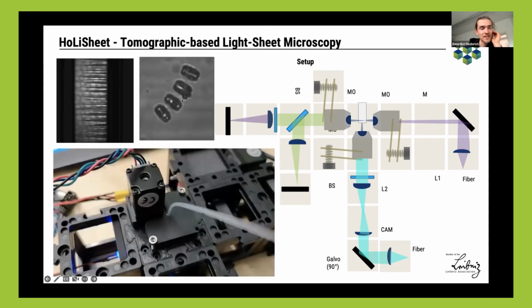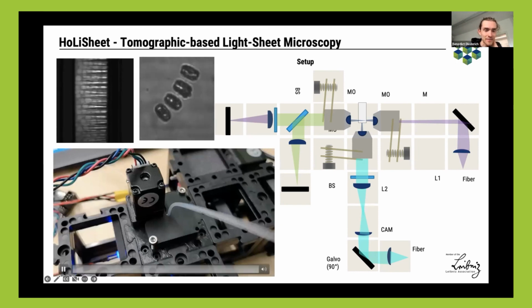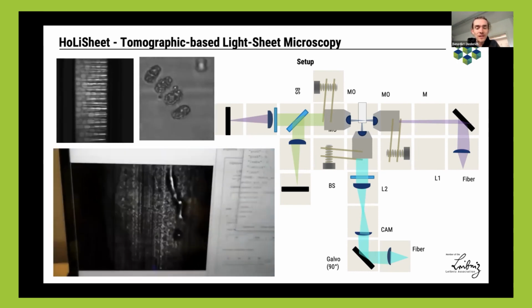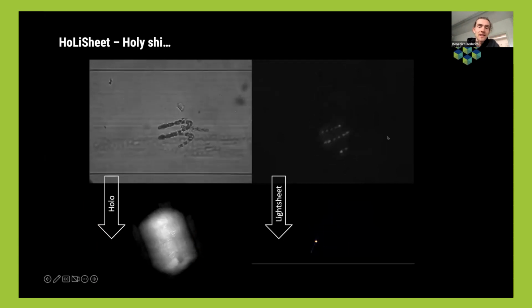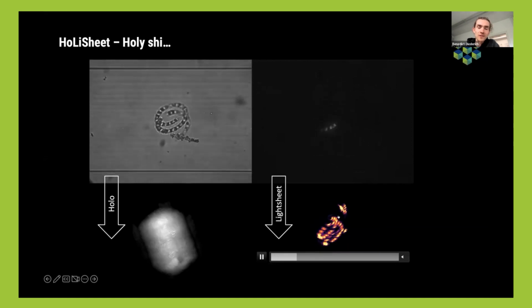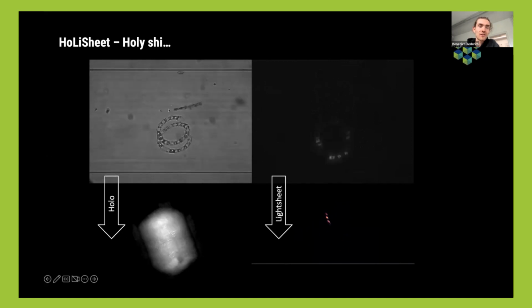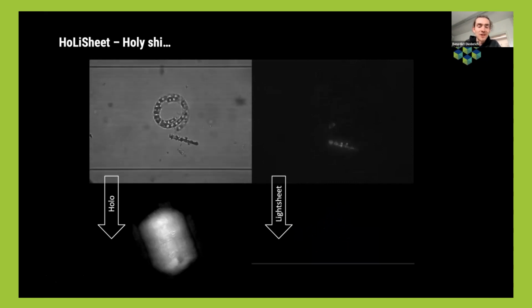What you see here, for example, is one algae. These are some beads I quickly labeled, and this is the rotating capillary. So this whole system kind of works, and we also tested that in the field. And so the reconstruction of the fluorescence here already looks quite okayish. However, for the holographical signal, I think some more computational or algorithm challenges are to be solved there.